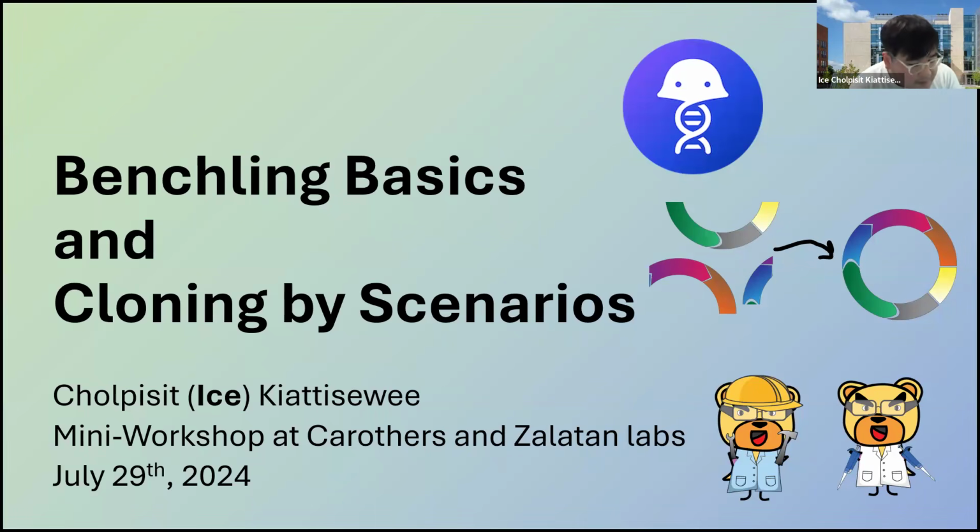So just a disclaimer, this presentation will be recorded, and I'm planning to share it on YouTube so that others apart from just our group can access and take a look at it as well. The materials will be turned into a PDF so that people can access these public Benchling files from the links that were put there.